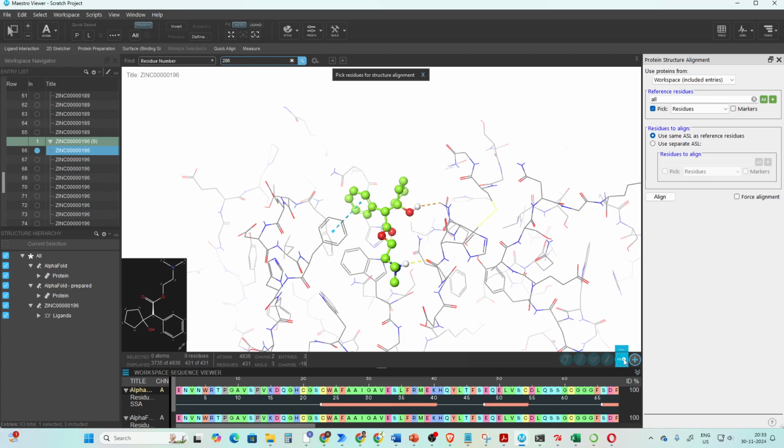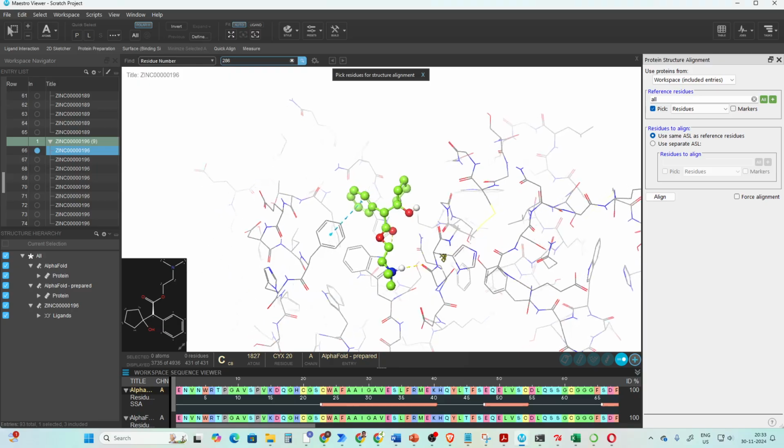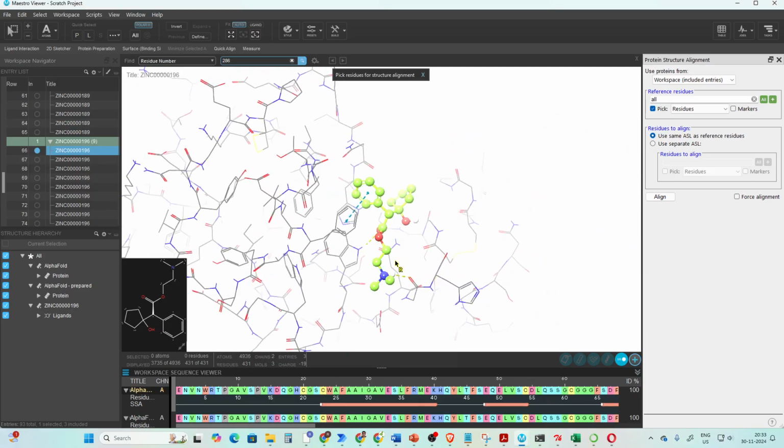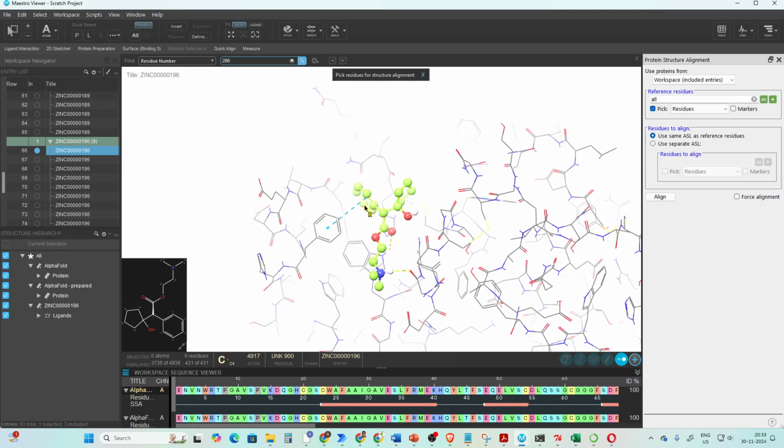There is some kind of button here, so you have to keep it in the on state. If you show this properly, we can remove these classes and then that's it. So there are two hydrogen bond interactions and one pi-pi interaction.